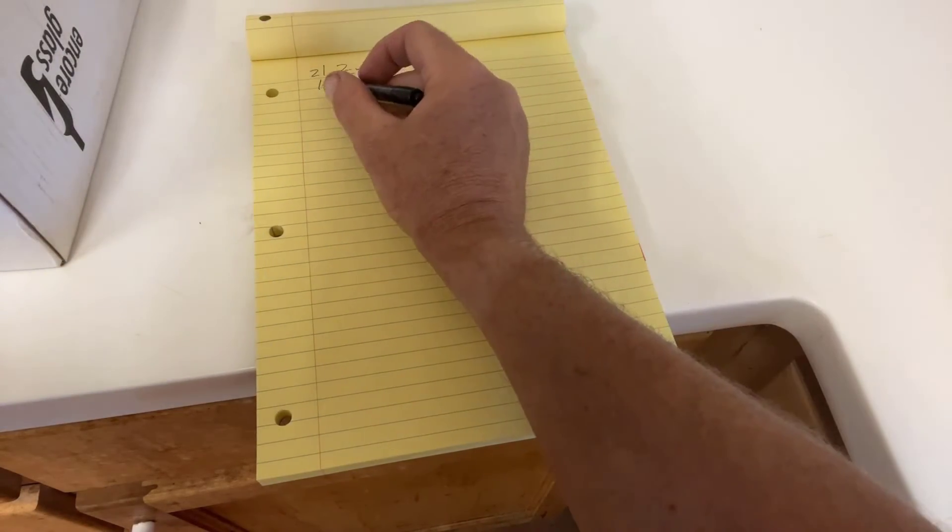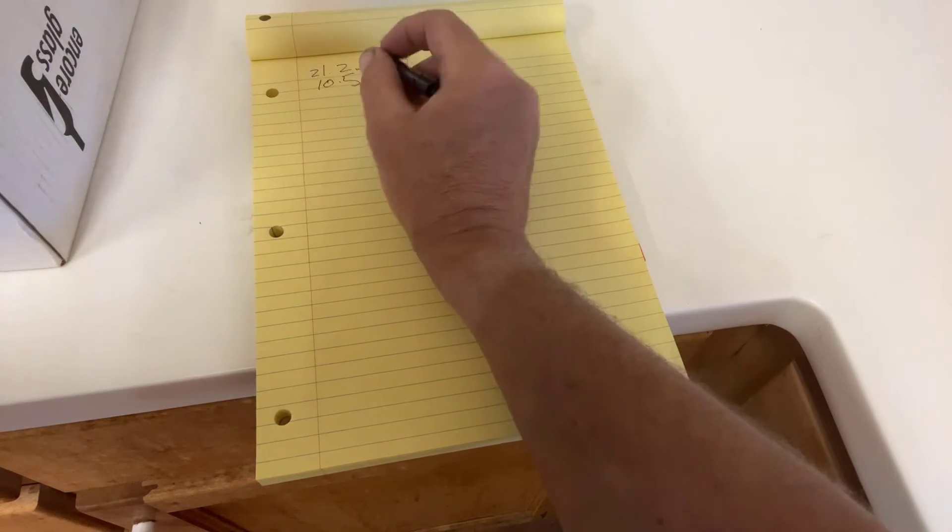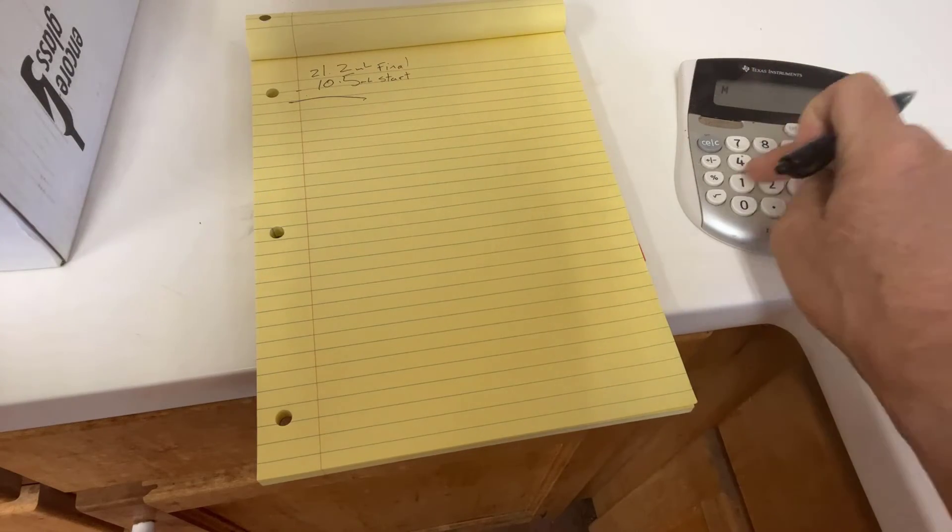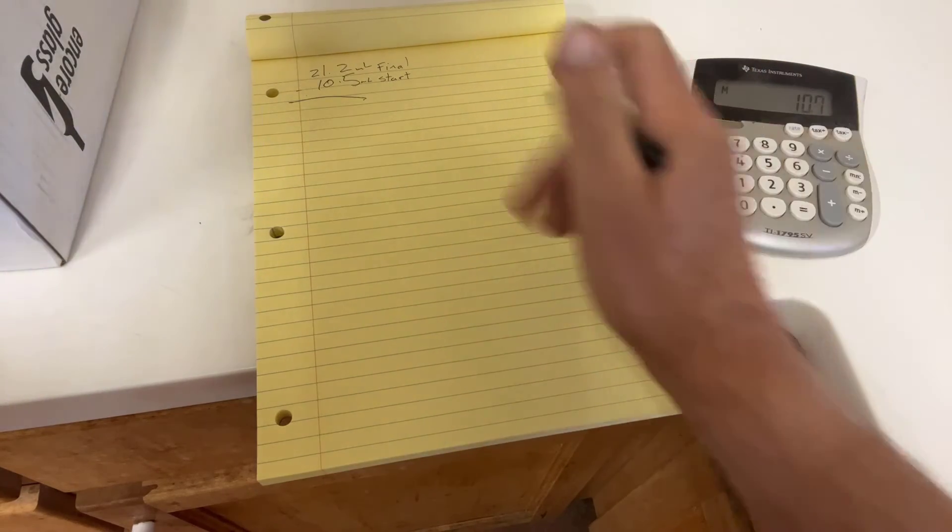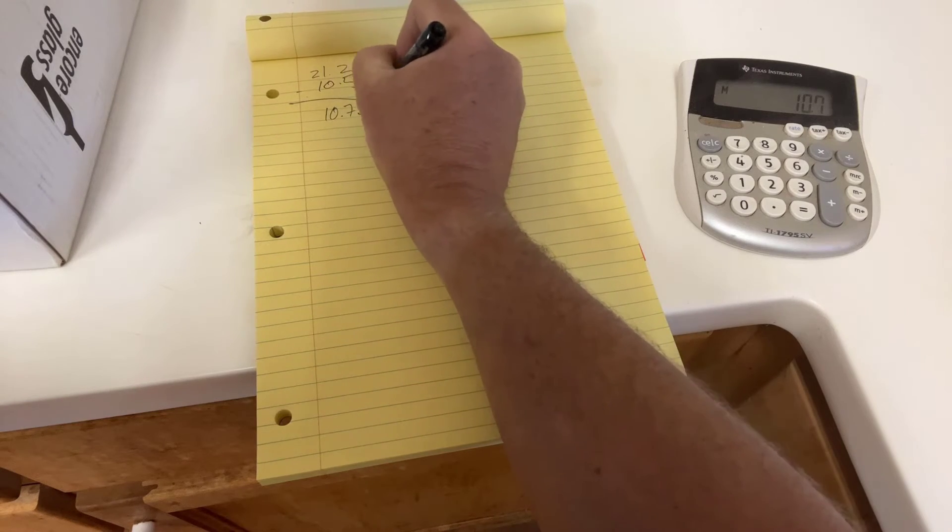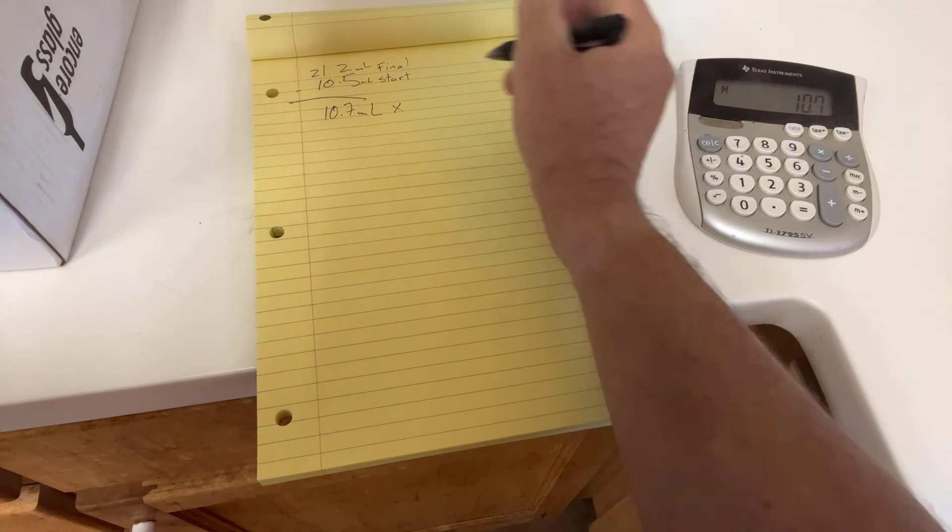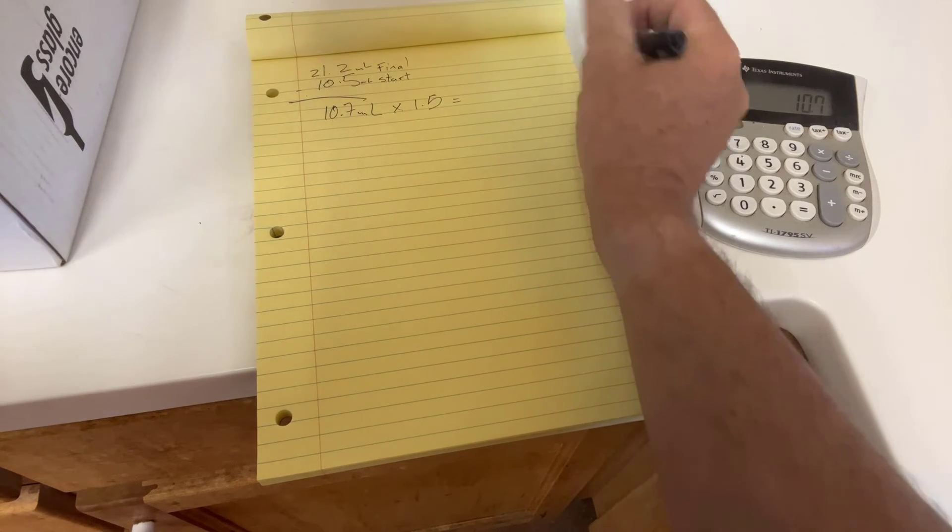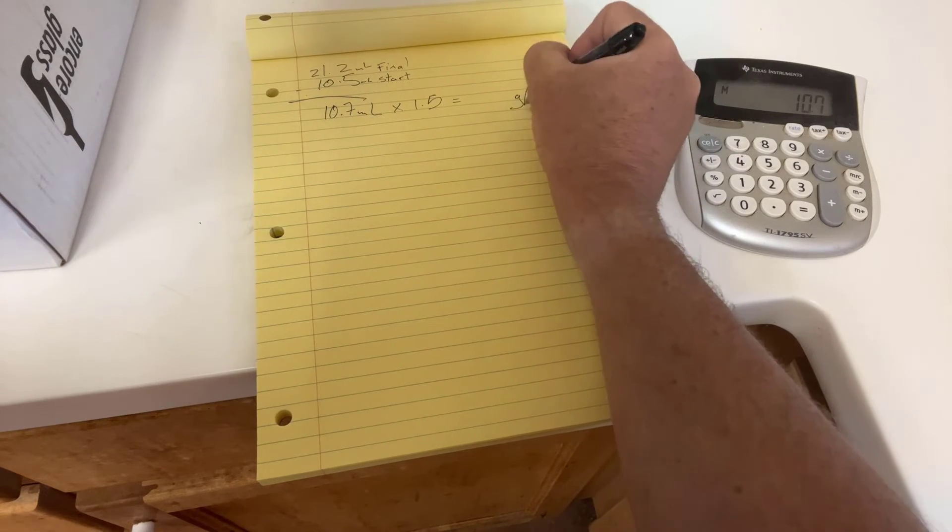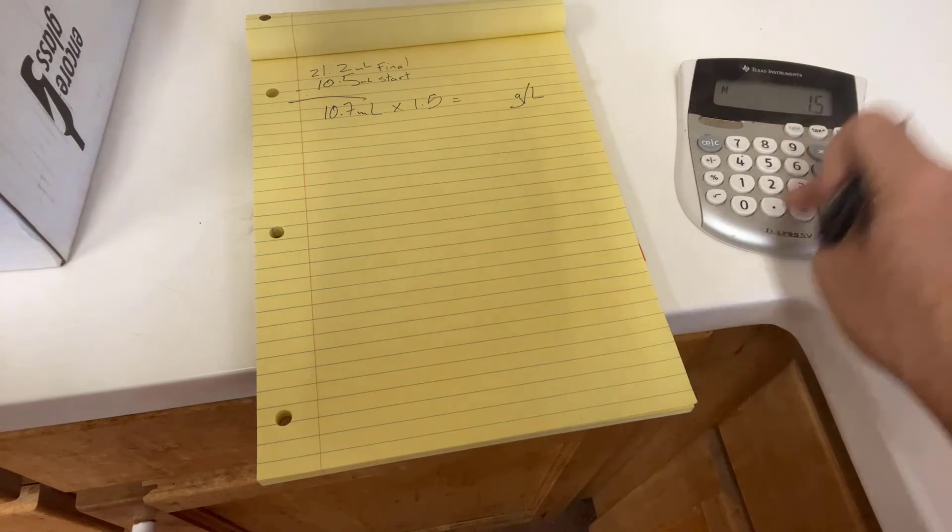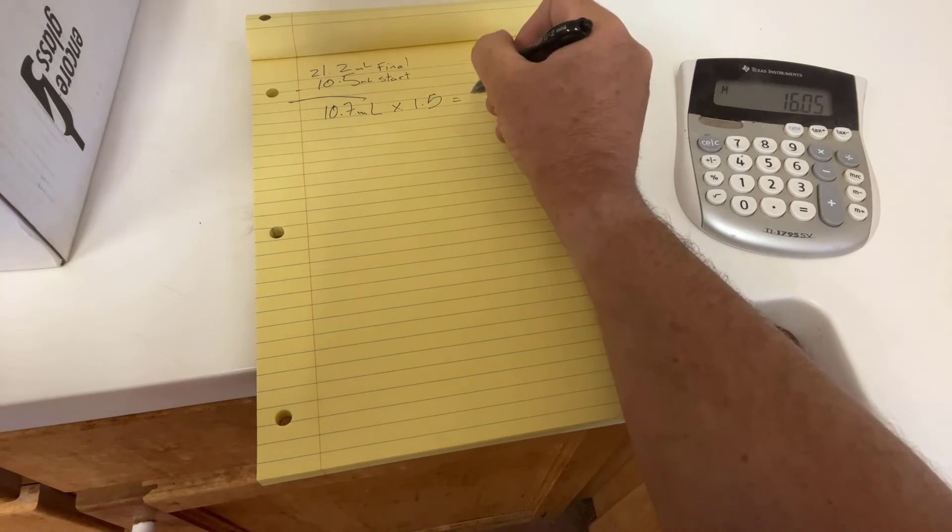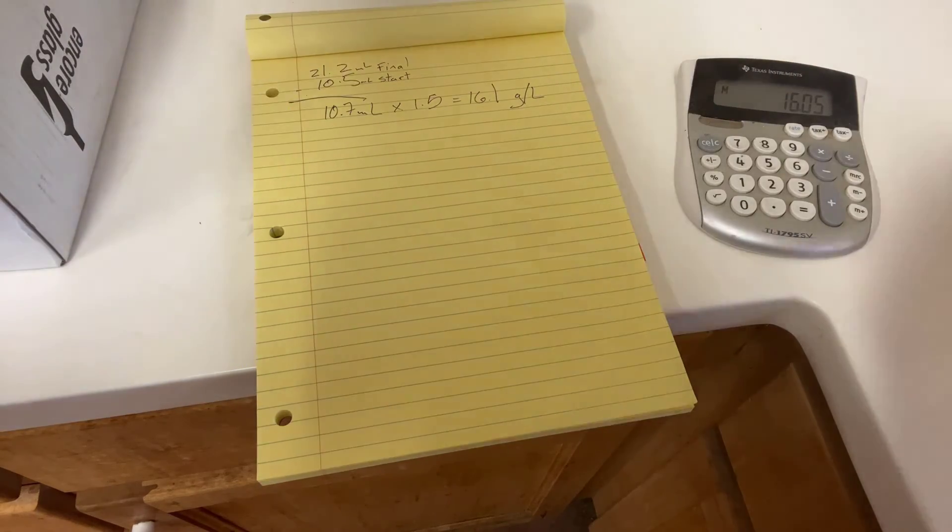Okay. Here's how things are calculated based on using 0.1 normal sodium hydroxide and 5 milliliters of juice sample. The burette started at 10.5 milliliters, ended at 21.2. So we're going to take that delta: 21.2 minus 10.5 equals 10.7 milliliters. We're going to multiply that 10.7 by 1.5, and that is going to tell us grams per liter of TA. 16.05. So we're going to round that up to 16.1 grams per liter TA.